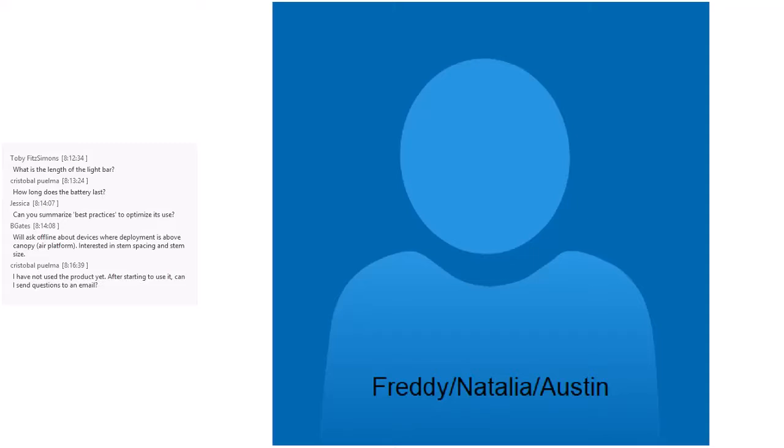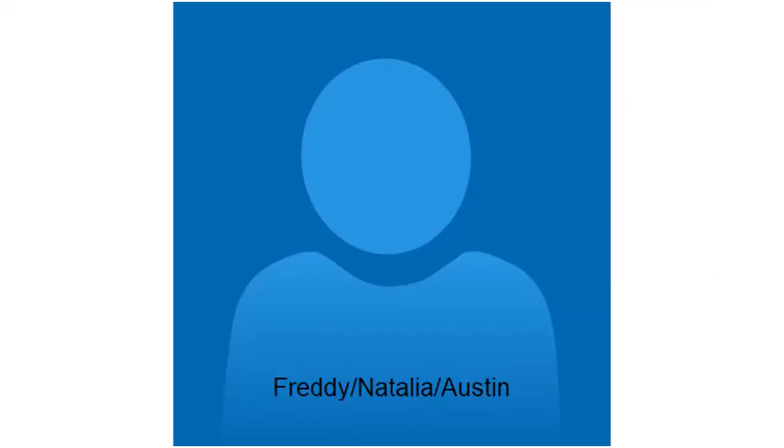Hi, good morning. We are Freddy, Natalia, and Austin from Mars Inc. We work in a cocoa plantation in Ecuador. We have the former model of the Canopy Measure. We want to follow up on the earlier questions about how to optimize the use of this tool. For example, what is better for the data record?